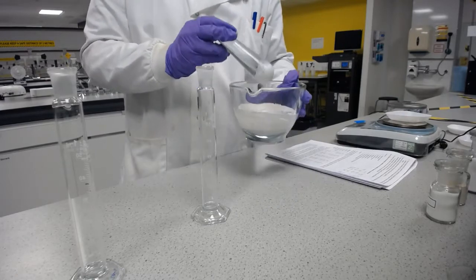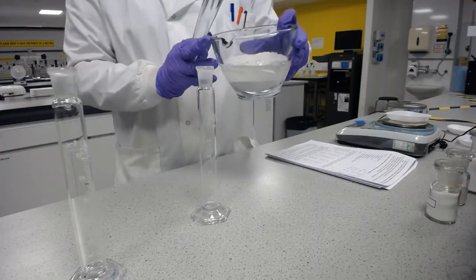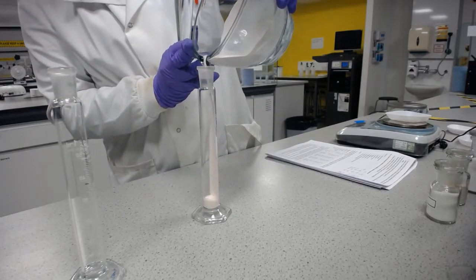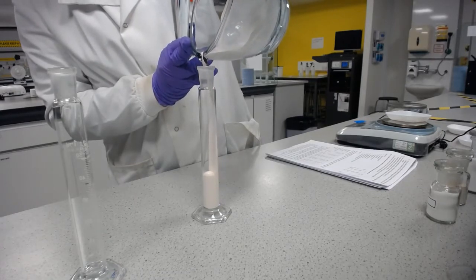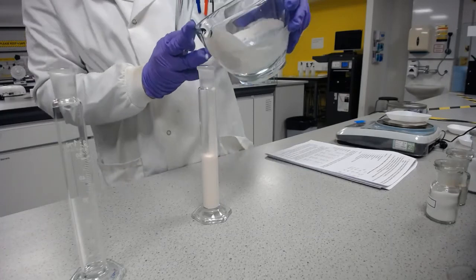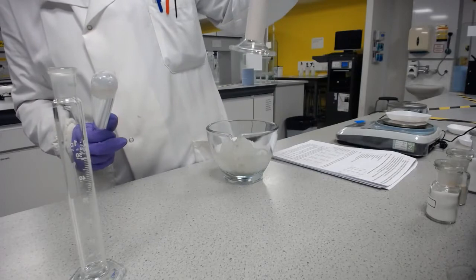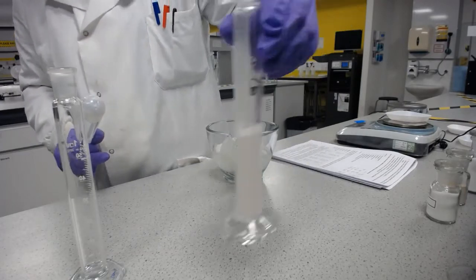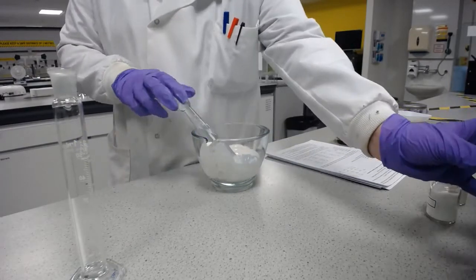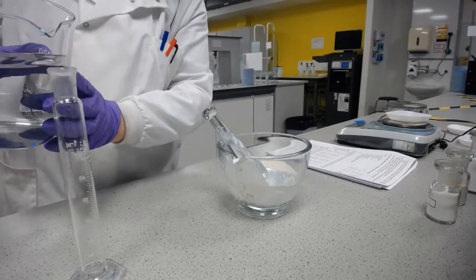You may wish to use a funnel to now pour this into the measuring cylinder where it will stay. You can see a relatively smooth consistency coming out, but I do still have a few lumps in the bottom. That's okay. Now I've put this in the final cylinder, I know I've still got 18 millilitres of water to play with, which I can use to rinse out all the parts from here that haven't quite made it in.